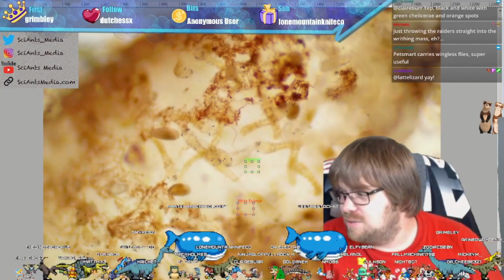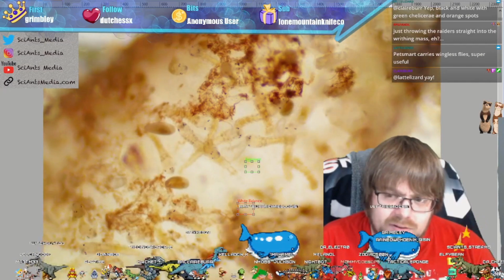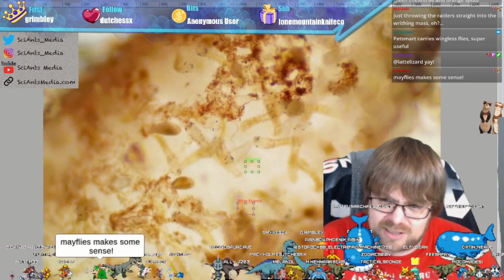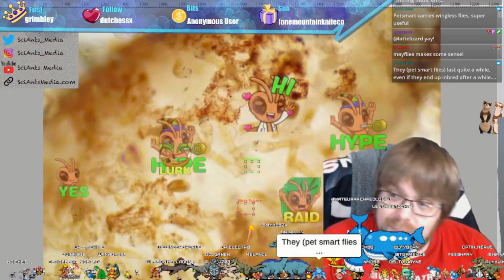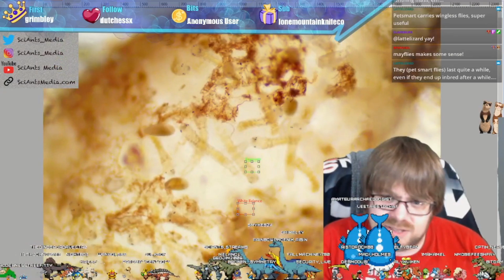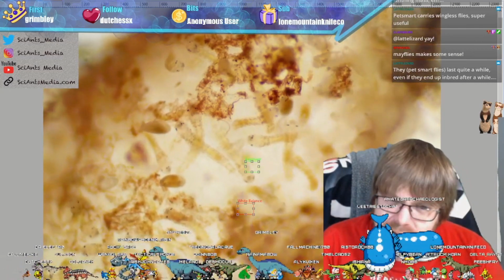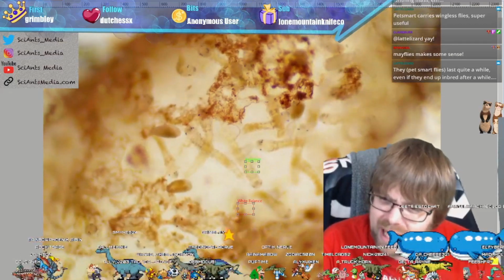And I noticed as soon as I opened up the plate, the dish looked inherently different. This giant sac was huge yesterday, like double the size, and it looks like it shriveled down. It just looks like the embryos have burst and they've started to come out. There's some on the surface now outside of the actual egg sac, and they're kind of digging through it. We don't yet know what they are, but I always find it really cool to look under the microscope and see how they behave and what they do.